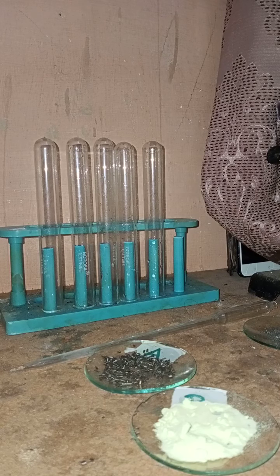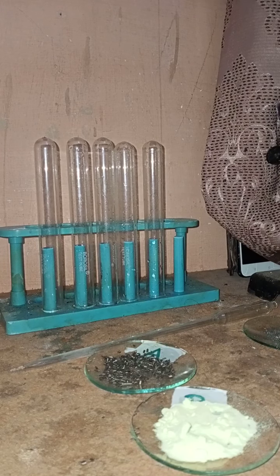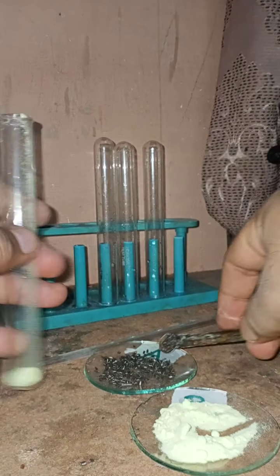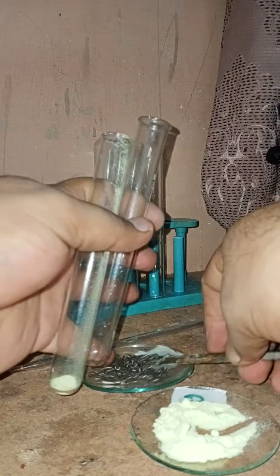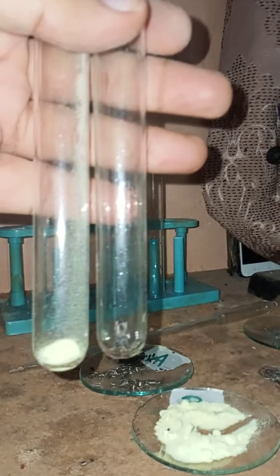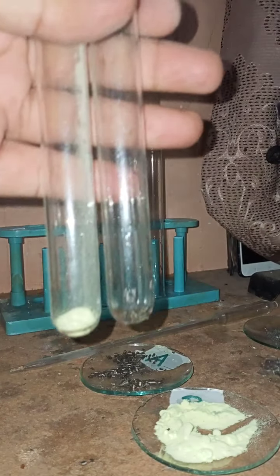And the reaction of iron fillings with carbon disulfide. So we have these two test tubes. In one test tube I am going to add one spatula full of sulfur powder. In the other I am going to add some of the iron fillings. You can see the iron fillings and the sulfur powder inside the test tubes. And now I am going to add the carbon disulfide in both of these test tubes, and let us see what happens.